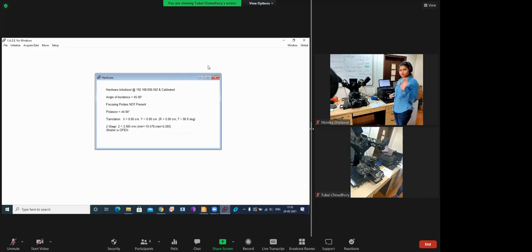So we'll start with scotch tape, and then the second one is where we just marked with the help of a marker. We have just marked this in black color. That's it. We'll explain these two examples in the case of simple glass. If you have some specific kind of glass, you can go for it. Right now, due to lockdown in IISER and NCL, we don't have any specific glass with us.